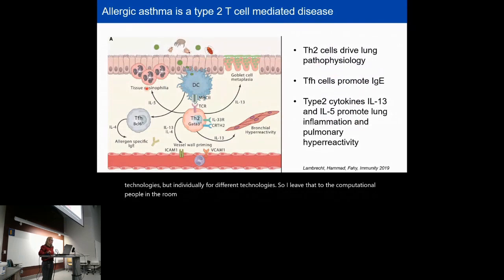Okay, in the last 5 minutes, I just wanted to quickly highlight one of the things we're doing in my lab in which we've utilized sequencing-based spatial transcriptomics, and I promise I'm not going to get too much into the weeds of the details. I'm actually an immunologist, very interested in how immune cells function in different tissue environments. One of the disease states that my lab uses to understand that question is allergic asthma.